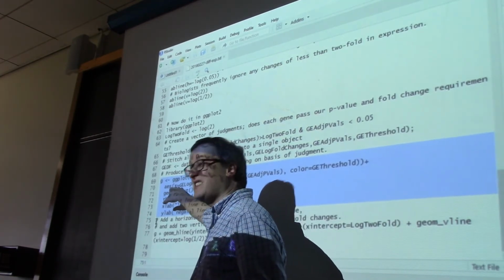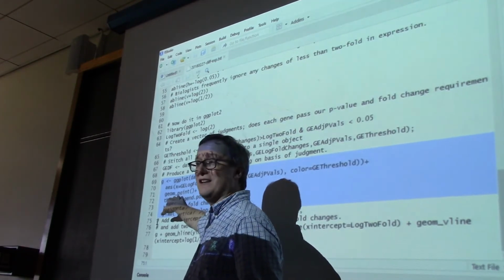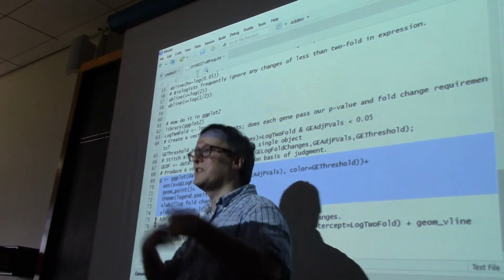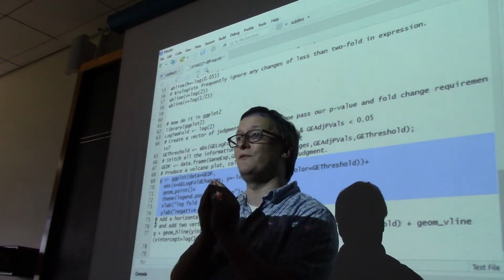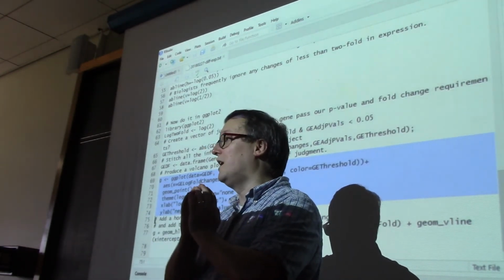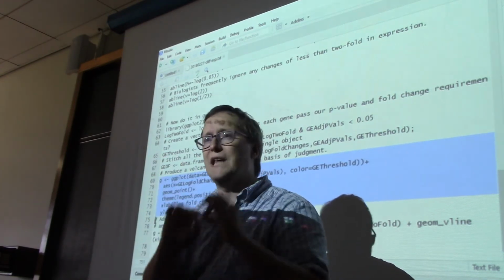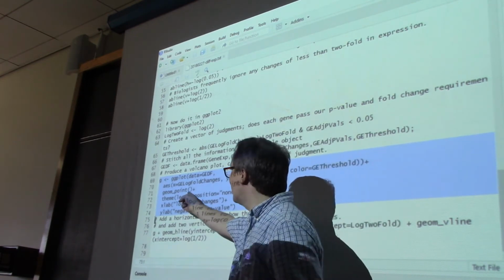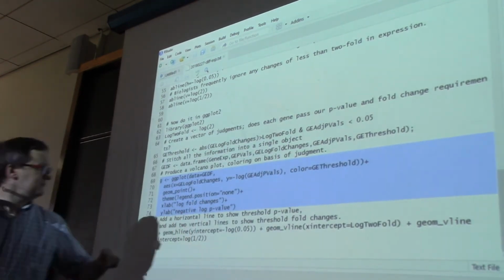Having set up the aesthetics of the plot, we're now going to specify that it's a scatter plot. And the geometry of point, geom_point, is what they use for defining this. Alongside this, we could do things like specifying the shape of the points. We could specify that they have an alpha value so that you can see if some are overlapping or not. You can set their color. You can set all kinds of nonsense. In this case, I've simply run geom_point without any special additions.